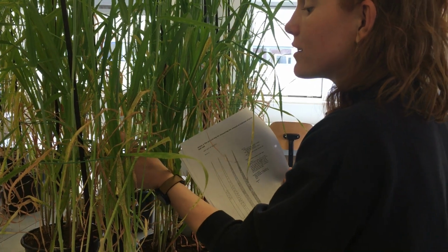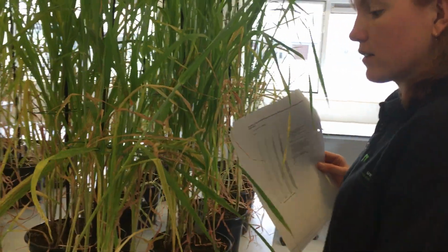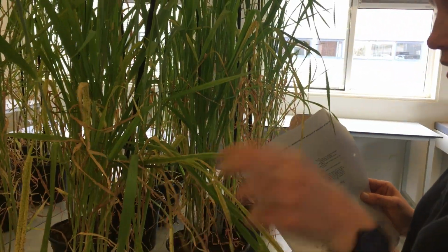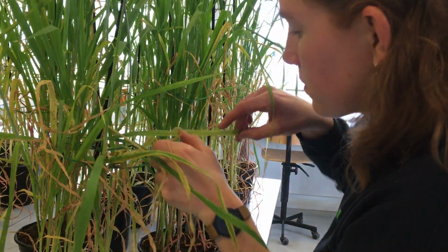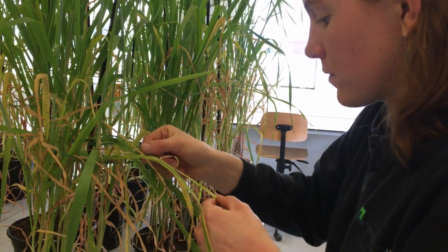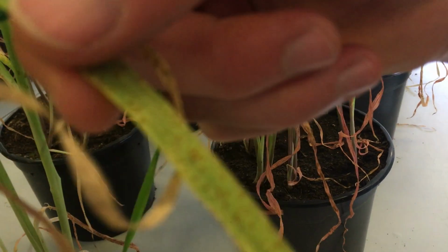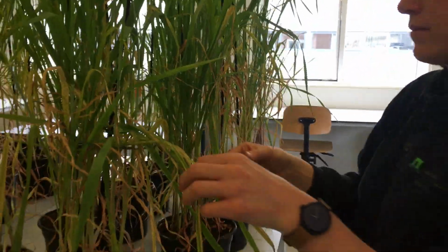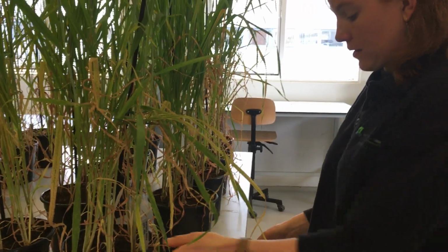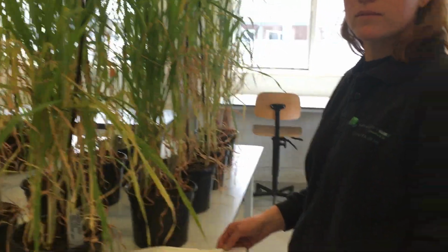This one has a lot, so that's another 80%, I think. And one more leaf. Let's see here. It's also, I think... Can I have a zoom in? Yeah. That's really a lot. So the impression is about 60-70%. Okay, that's ACA. But in such a way, we will score all these plants.